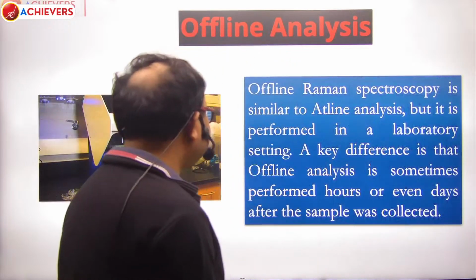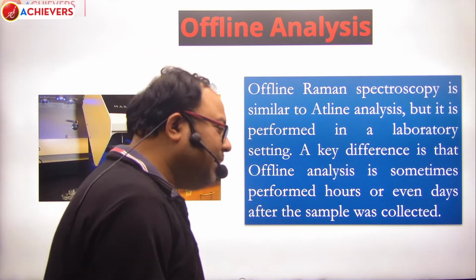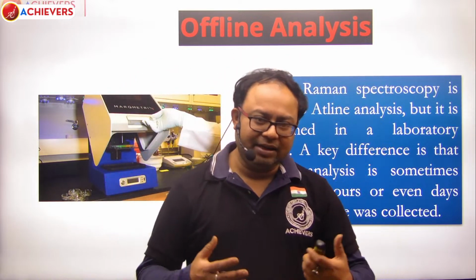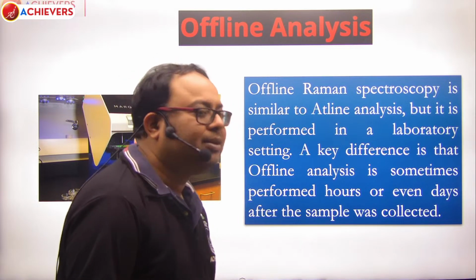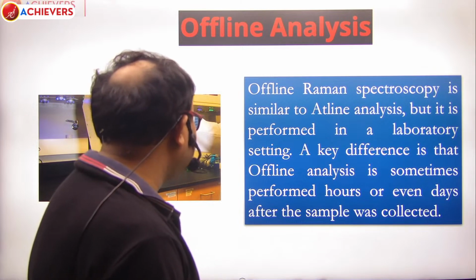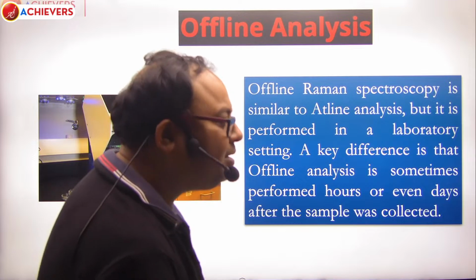Rest everything is same. Offline Raman spectroscopy is quite similar to at-line analysis. In fact, the instrumentation, the technicalities are very much similar. The difference is the offline analysis is performed in a laboratory setting. A key difference is that offline analysis is sometimes performed hours or even days after the sample was collected.